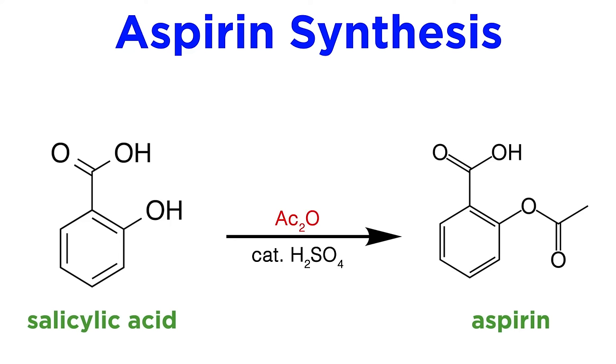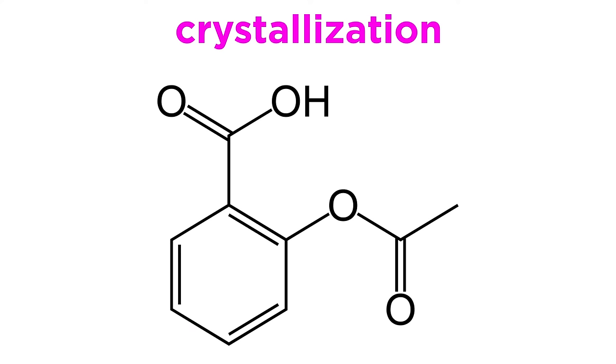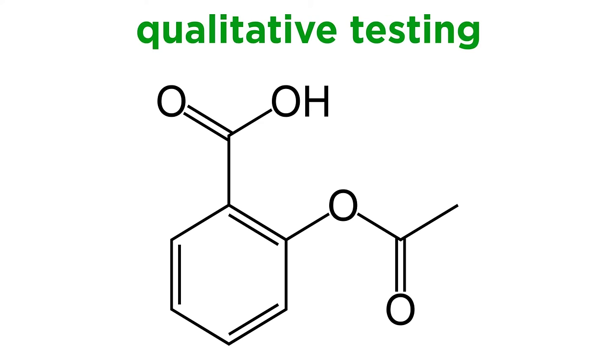We'll add the anhydride to salicylic acid, use a strong acid as a catalyst, and heat the reaction to completion. We'll then perform crystallization steps to isolate and purify our aspirin. To finish, we'll use a simple qualitative test to see whether or not we have made and purified aspirin.